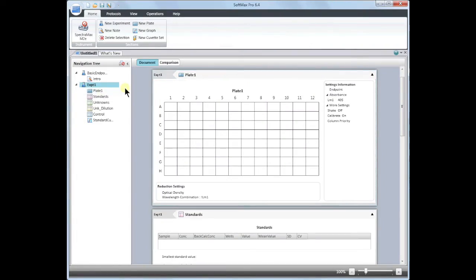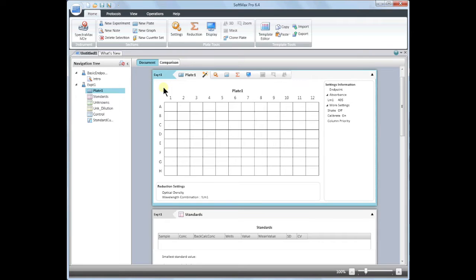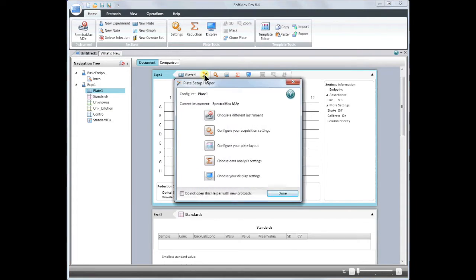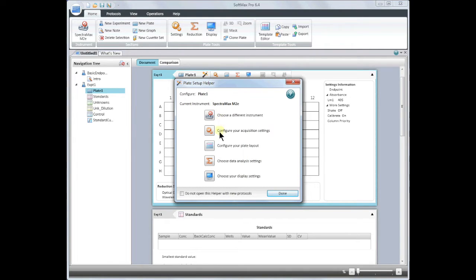The easiest way to set up your plate read is to use the Plate Setup Helper. If the Plate Setup Helper does not automatically pop up, click anywhere in the plate window to activate the menu, and then click on the magic wand. The Plate Setup Helper will guide you through each step in the software to set up a template and acquire data.